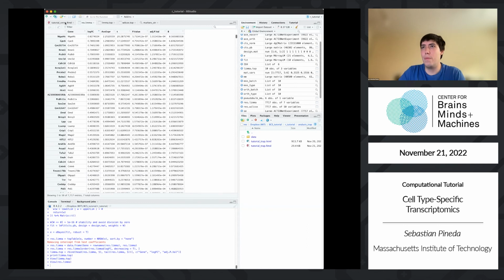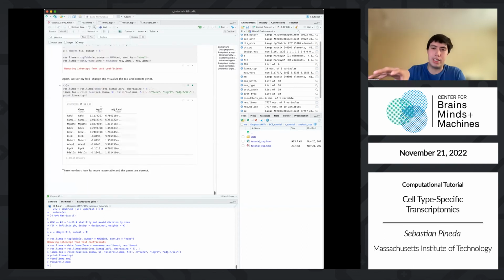So now that I have this, I can do exactly the same types of further downstream analysis as with the TRAP data, like pathway enrichments. It's now in a nice format that I can feed into a package like WGCNA and all sorts of network analysis. And I can treat the data identically across both assays. I can even compare them directly across both assays, which we often do.